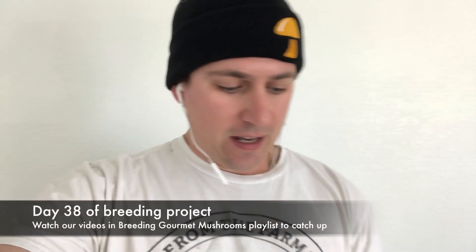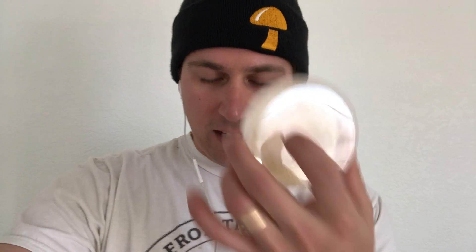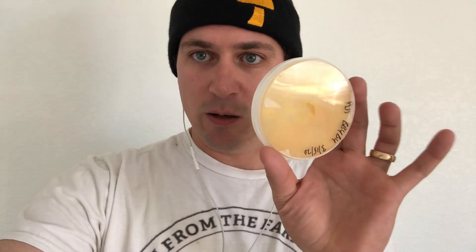Hey guys, it's Gary with Fresh From The Farm Fungi here in Denver, Colorado on day 38 of our breeding project. We've got some of our crosses that are getting ready to be transferred down to grain, which is super exciting. This pink oyster is almost completely covering the plate, and so is this one. We've got our piapini clone from tissue culture from that jar culture, and then I've got about 45 more isolate crosses that I'm going to be growing out onto grain.